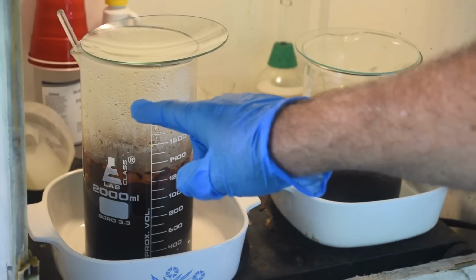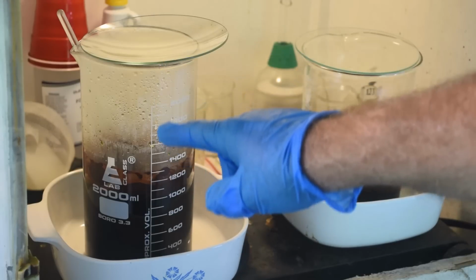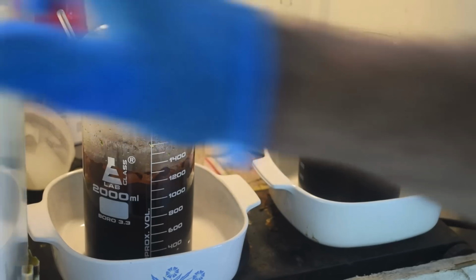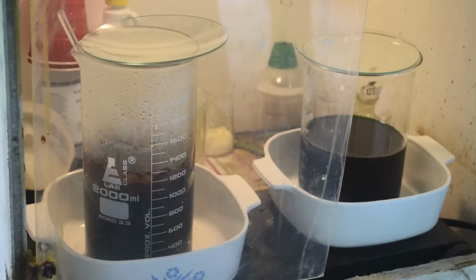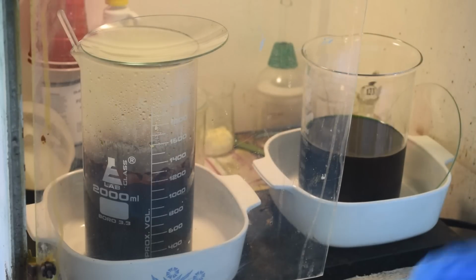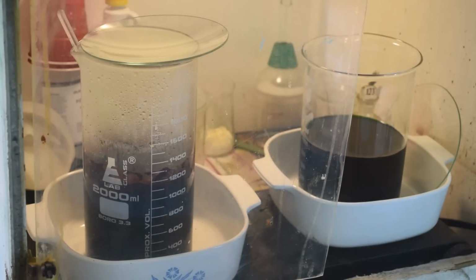I don't know if it's showing up on the camera or not, but the top of this beaker over here is filled with a green gas. That's chlorine. That is filled with chlorine. So, got to do this in a fume hood for sure. It's dangerous. All right, so let me get about 3.5 scoops of ammonium chloride in this stuff, get it dissolving, and we will do that again.